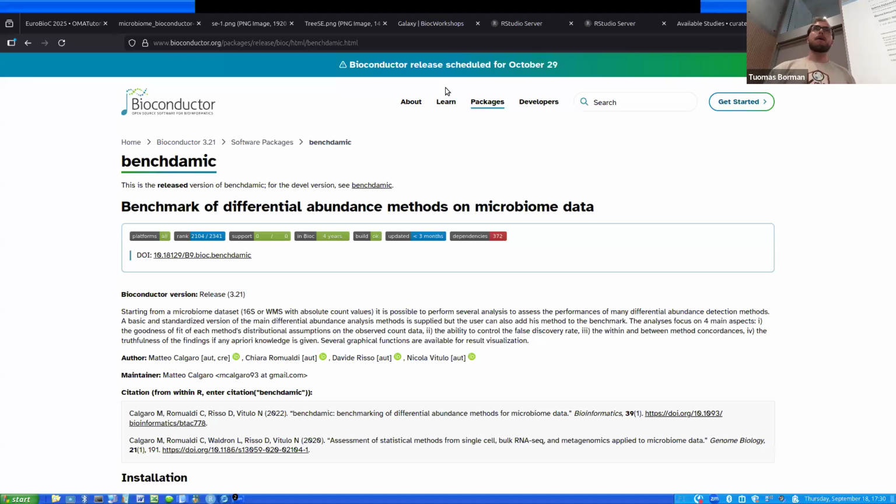So it is one-to-one mapping. So you can use the alternative experiment. But if you have metabolomics data, for instance, where some samples are missing, then there is MultiAssayExperiment, which is a more capable data structure. And there are examples on that also in the online book.